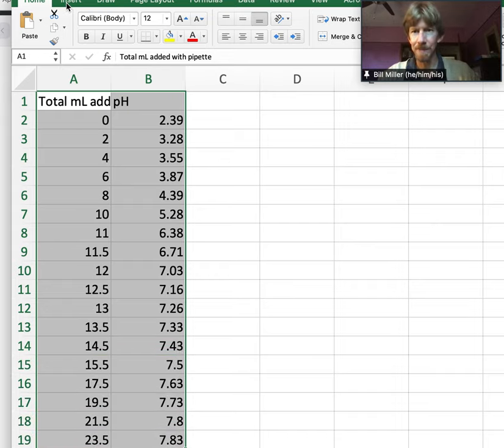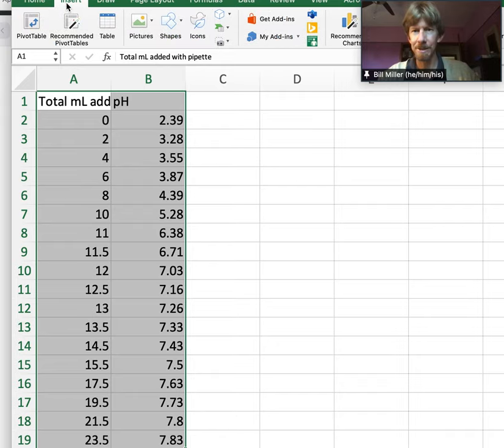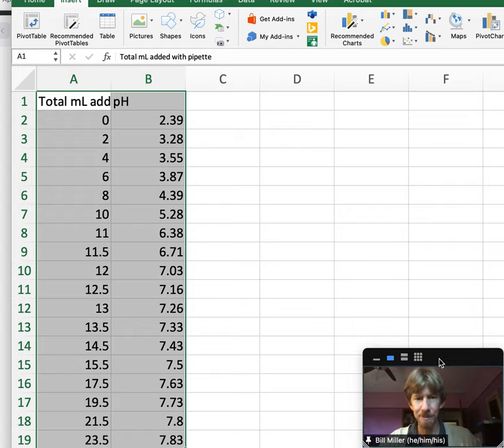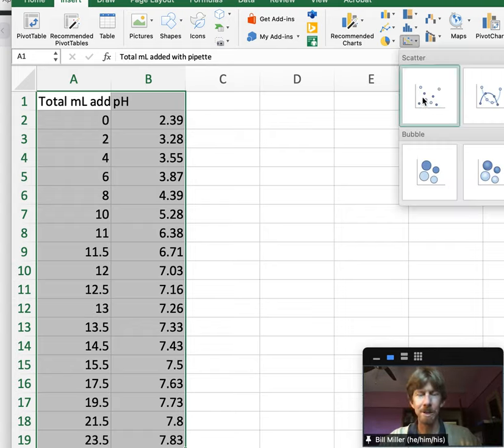Then go to the insert menu, and right underneath is the chart option. You want to chart and do XY scatter.